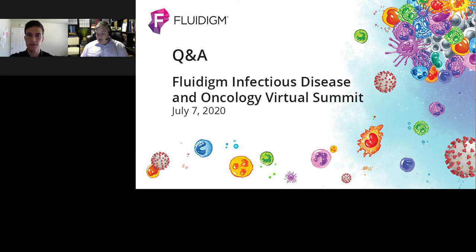So right now there is no automatic gating in FCS Express. However, we do have, and we will be having more of, predefined templates for analysis. Just like Dave showed today, the MaxPar immune profiling assay template that he brought up is going to be able to be downloaded from the Novo Software website and from the Fluidigm website. Essentially, you'll have predefined gating positions and predefined gates for as many gates as you want. And when you load the data in, all of that part of it will be done.